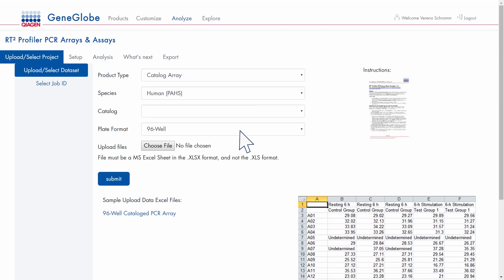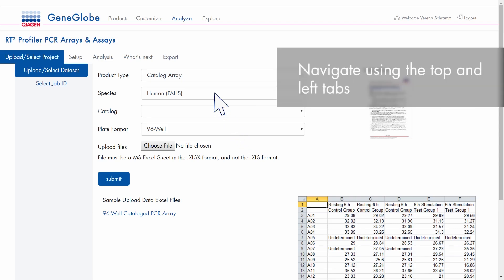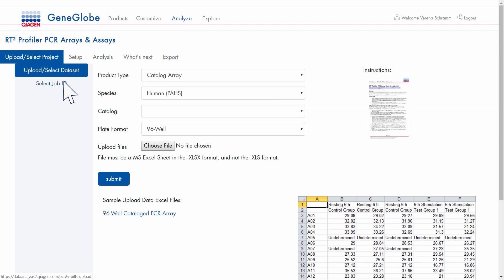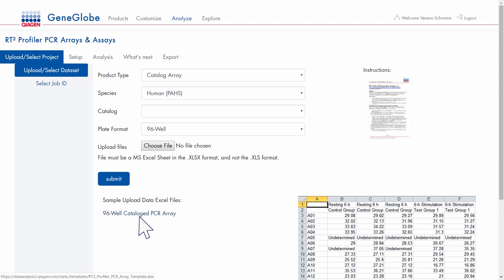Navigate through the module using the tabs at the top and left. Access detailed instructions for the analysis module and a template to help you format your data properly.